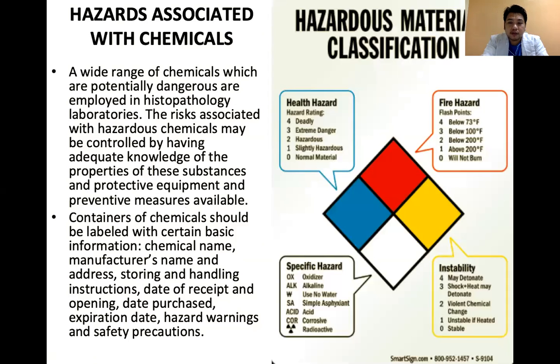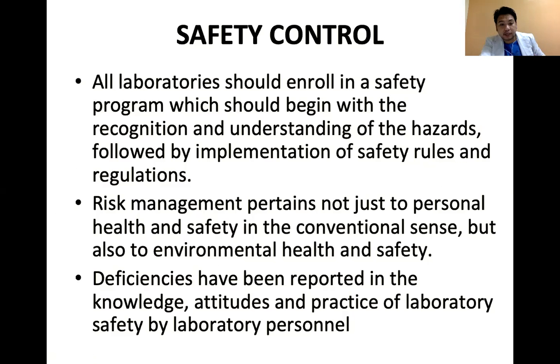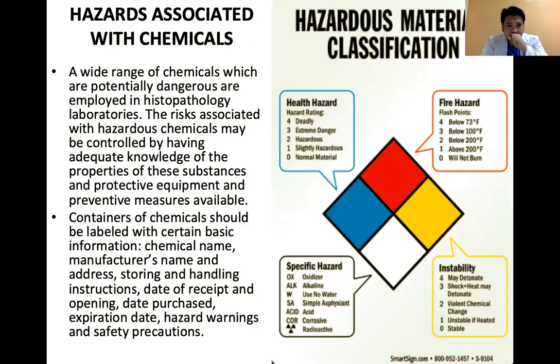So we have different types of hazards sa laboratory. Deficiencies have been reported in the knowledge, attitudes, and practice of laboratory safety by the laboratory personnel. Kaya nga, di ba, we have experienced a lot of hazards like fire, maraming hospitals na nasunog. Maybe perhaps they do not practice safety control.